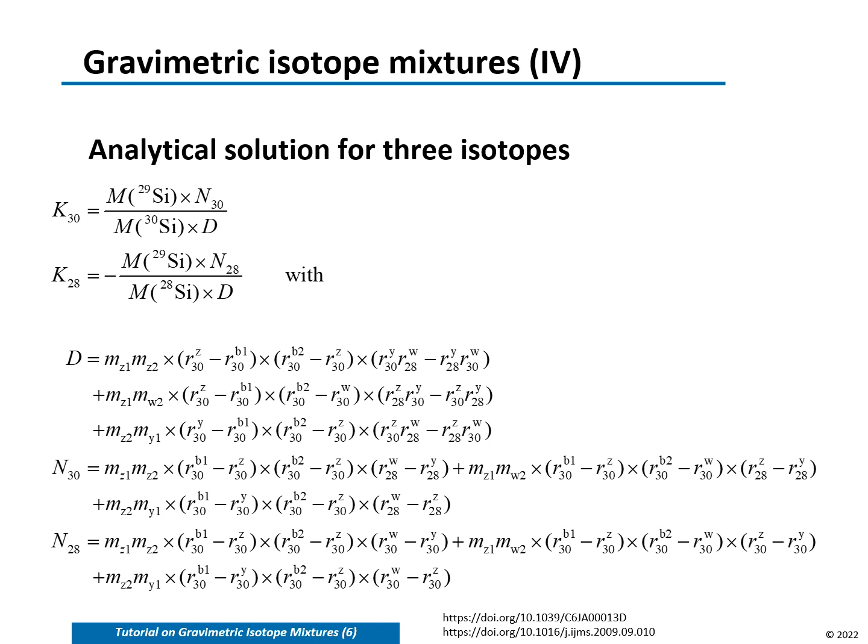In case of a 3-isotope system, like the already mentioned silicon from the last slide, the equations to calculate the K factors become more complex. But they still can be written down explicitly, like you can see here. The mathematics originally derived in the Avogadro project was successfully applied for the characterization of several magnesium isotope reference materials.